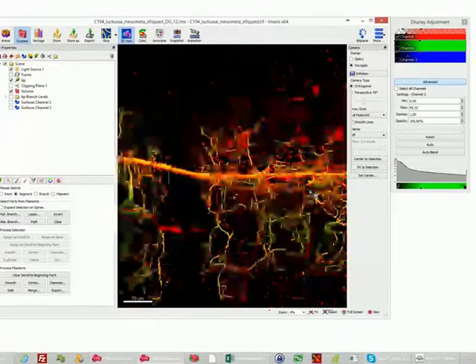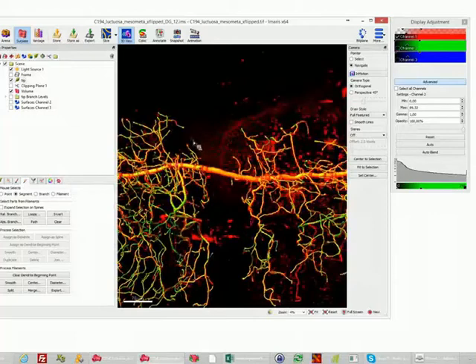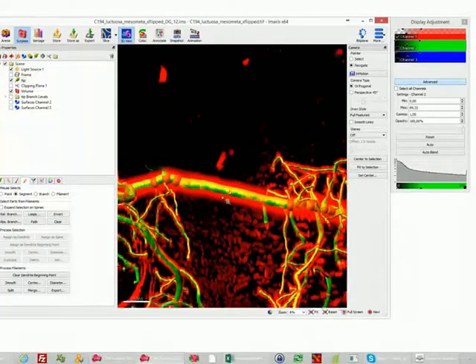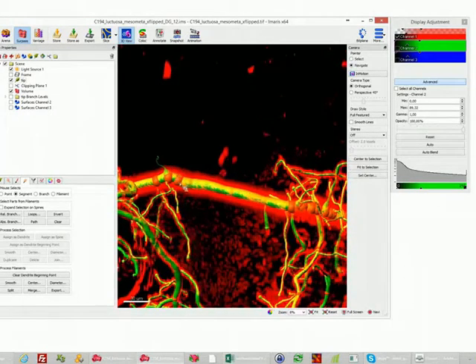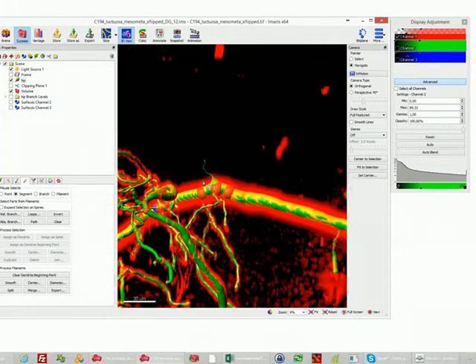And now I want to show you as well a little bit what you can do with manual editing. I didn't have to do too much, but a few branches were still there, false positives, and a few ones which I had to add as well. So here, for instance, we have one of the false positive branches, and so I can simply select this guy with my mouse. You see it's highlighted, and then you can delete it with a simple mouse click.